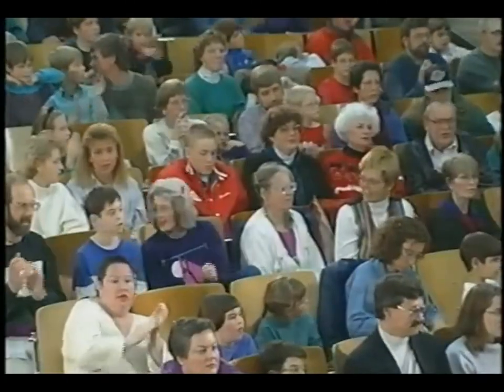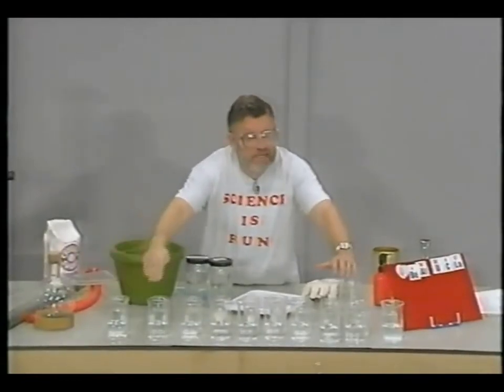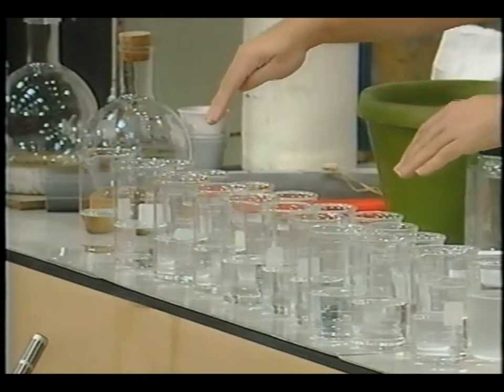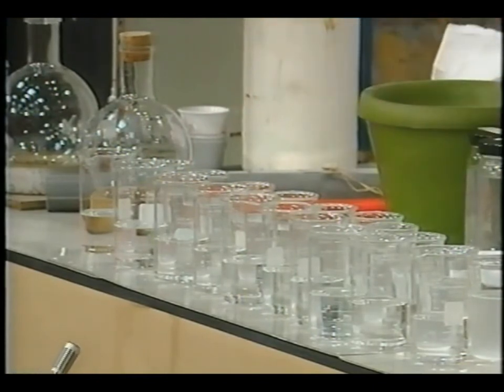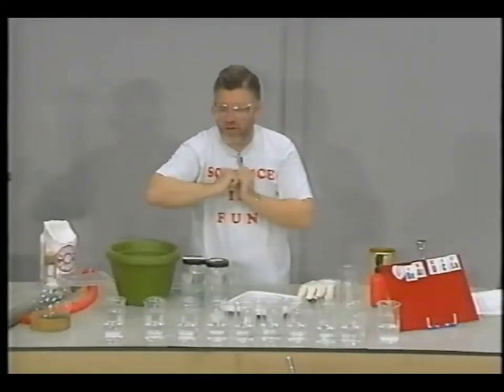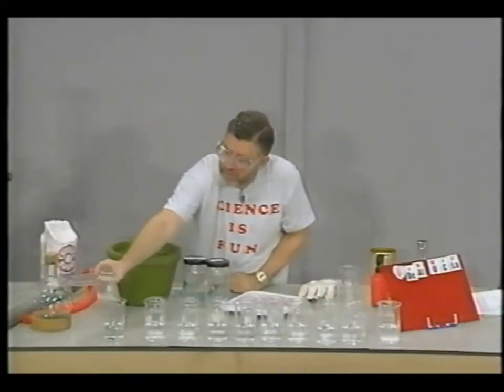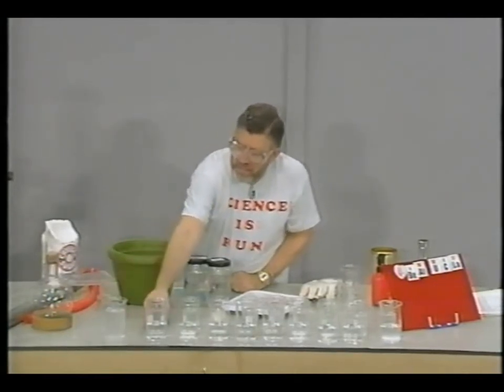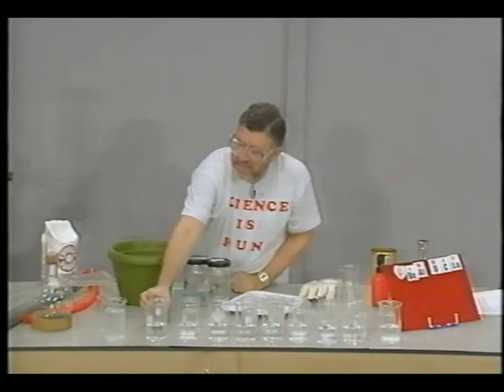Now let's. I have 10 beakers in a row, and I have another row of 10 beakers just behind them. And what I'm going to do is mix the contents of the beakers in the back row with what's in the front row, and we'll see what happens. So here we go. 1, 2, 3, 4, 5, 6, 7, 8, 9, 10.